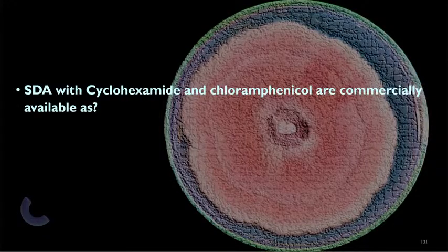Mycocell. So, sir, kailangan pa namin alalahanin yung commercial ano. Yes. I found it in a recall question in the Philippines, because sometimes in the Philippines they will ask us brand names of certain things. Okay, so be mindful of these things sometimes. So I added it here for you guys for your information.